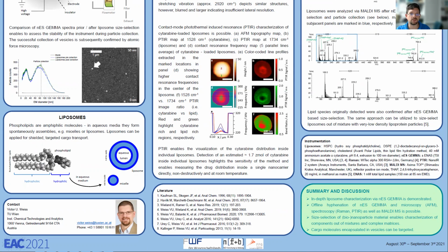And it's also possible to offline hyphenate gas phase electrophoresis with other analytical techniques: mass spectrometry, atomic force microscopy, spectroscopic techniques, and many others. Cargo molecules can be targeted, and it's also possible to size select liposomes out of complex media and out of complex samples.